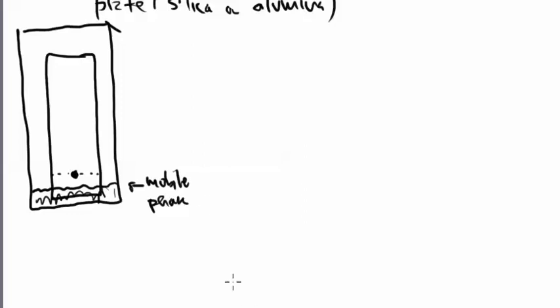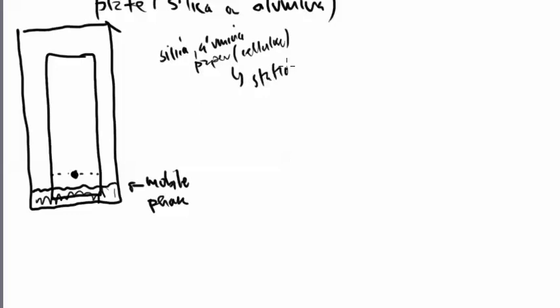So that's what we call the mobile phase. The alumina or the silica, so silica, alumina, or the paper. And when we talk about paper, it's really cellulose that we're talking about there. That is called the stationary phase because that's not really moving, right? That's on the microscope slide, or that is the sheet of paper. That's not moving. It's not going anywhere, so we call that stationary phase.